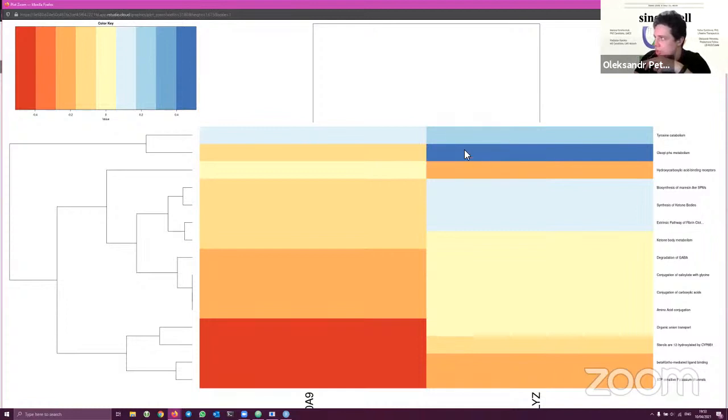So it's super enriched in the normal cells which are present in the healthy tissue and not that much in the hepatocellular carcinoma tissue. However, it's not for sure that this is a disease relevant pathway. So it's not like we can target this pathway very easily just because of the knowledge of this pathway, or not likely it's super relevant for us in the context of separate markers. However, this is something already more interesting.